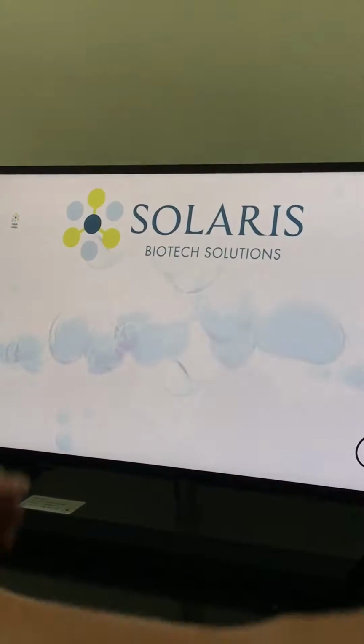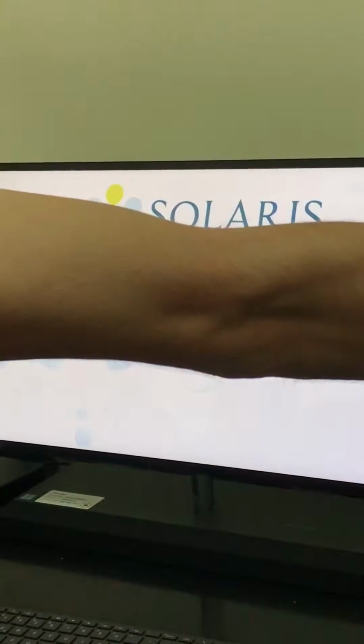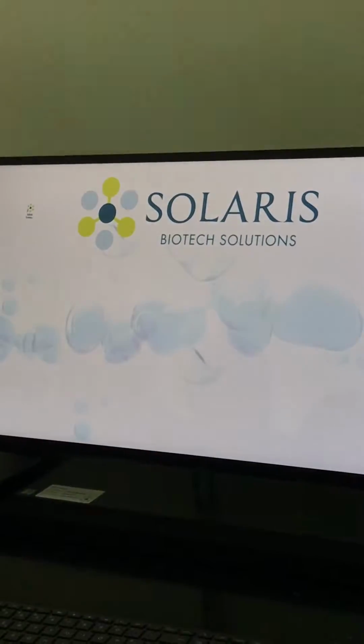Okay. Normally when all is switched off, switch on the electrical cabinet, then you switch on the computer.